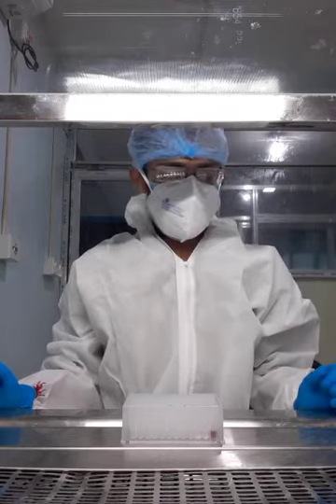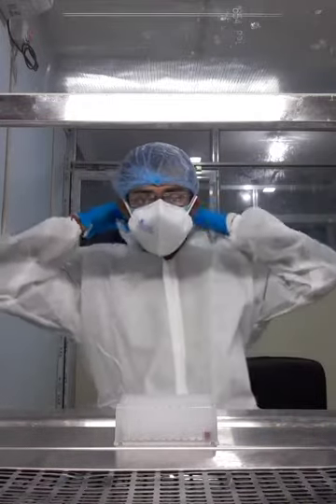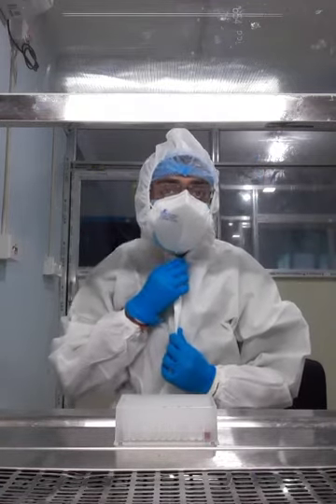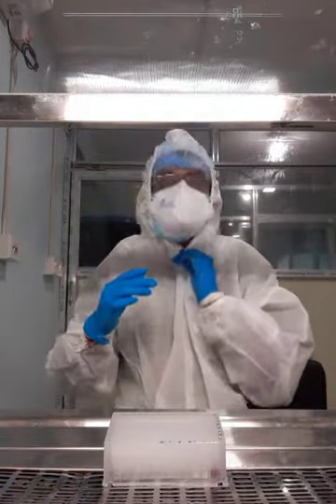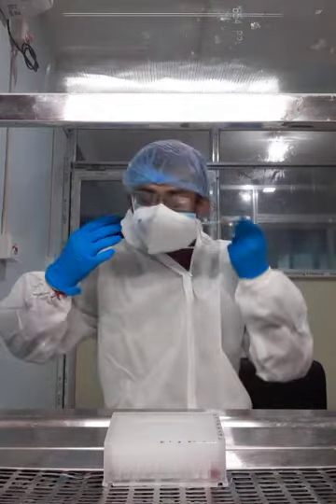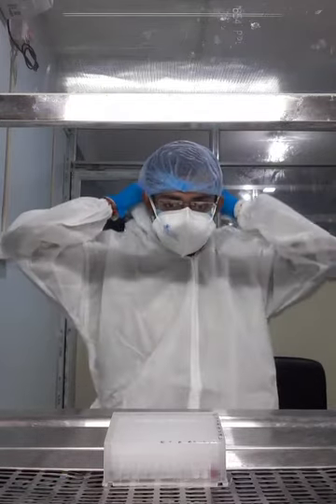Now it's time for very risky work: to put the VTM sample. Before putting the VTM sample, you have to secure yourself first. You have to put your cap on and wear your face shield, because you don't know whether the VTM sample is negative or positive, so you have to secure yourself.